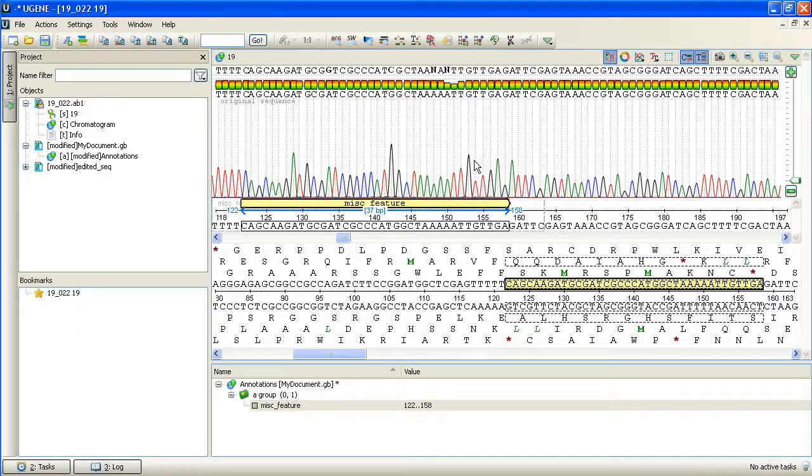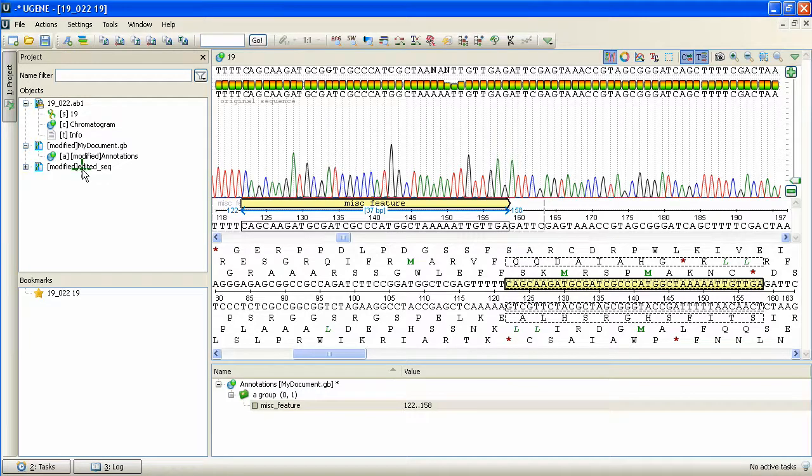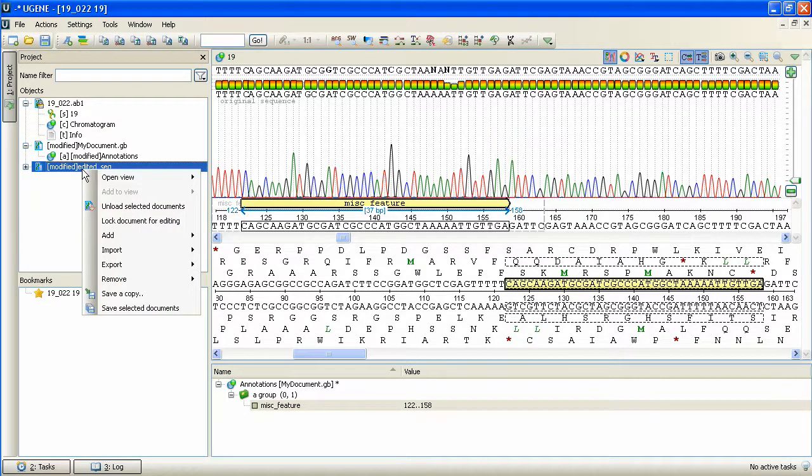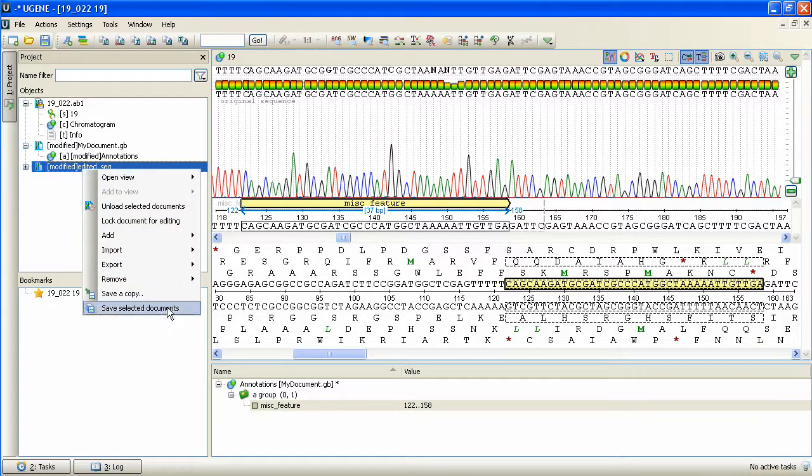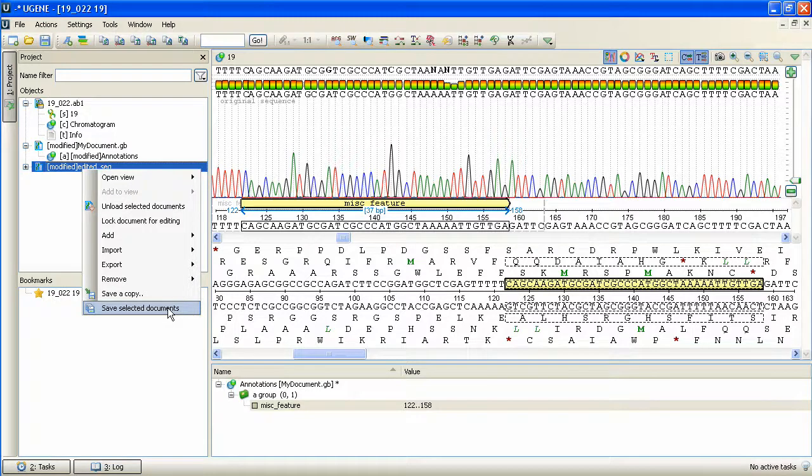Finally, we can save the document by right-clicking on its item within the current project view and selecting Save Selected Documents.